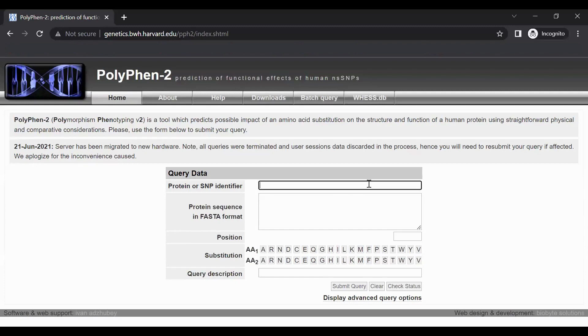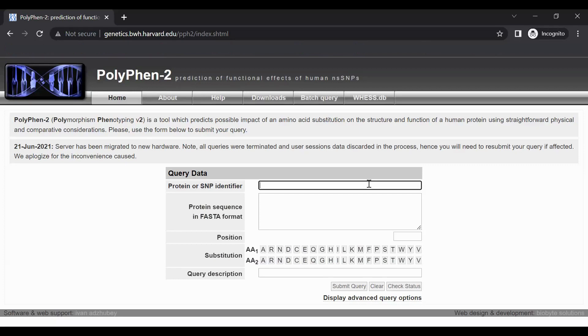PolyPhen-2 recognizes protein accession numbers and entry names from the UniProt-KB database. It also recognizes RefSeq identifiers and standard gene symbols. However, use of UniProt-KB identifiers is recommended.